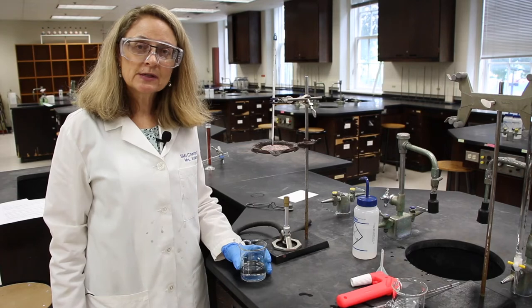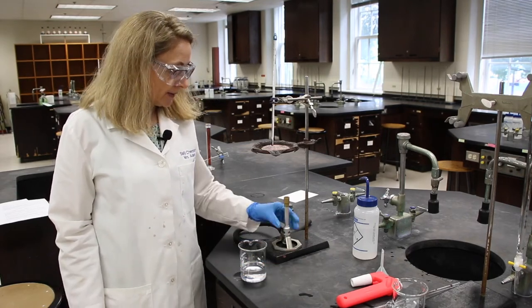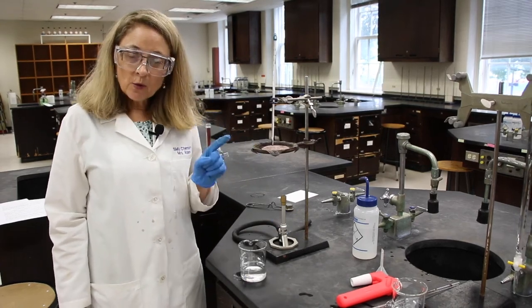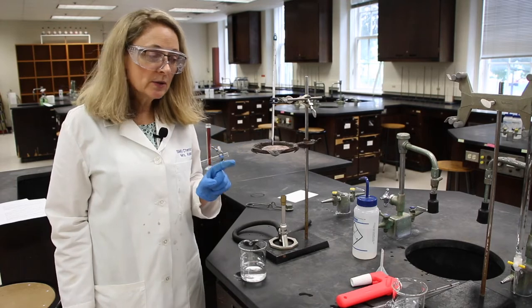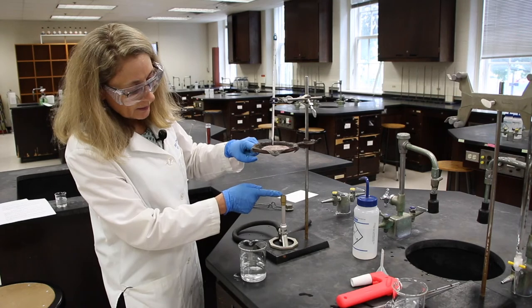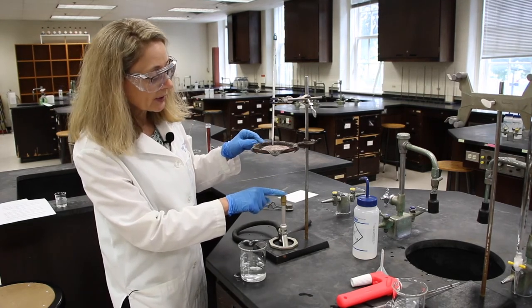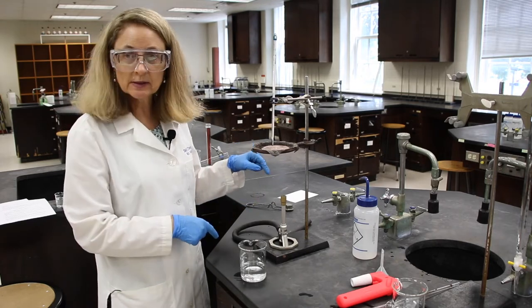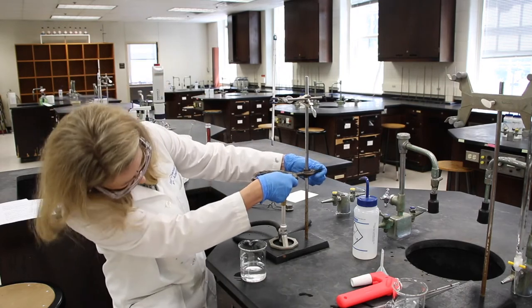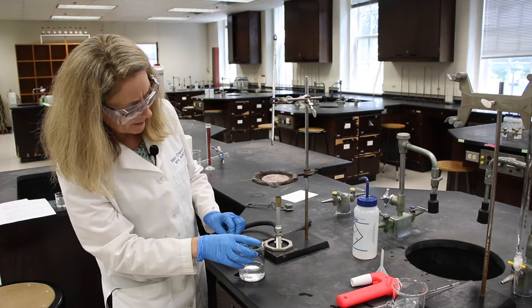The next step in our procedure — we're now in Part 2 — is to place a Bunsen burner underneath a ring with gauze. Before we heat anything up, it's always important to adjust all your equipment. As you can see, the barrel of the Bunsen burner is way too far from this ring stand, so let's adjust the ring stand to maybe two or three inches above the top of the barrel of the Bunsen burner.